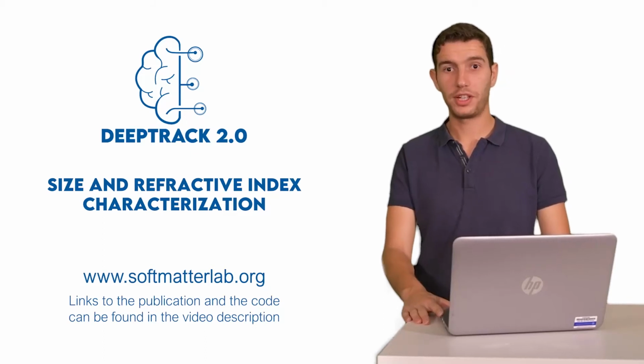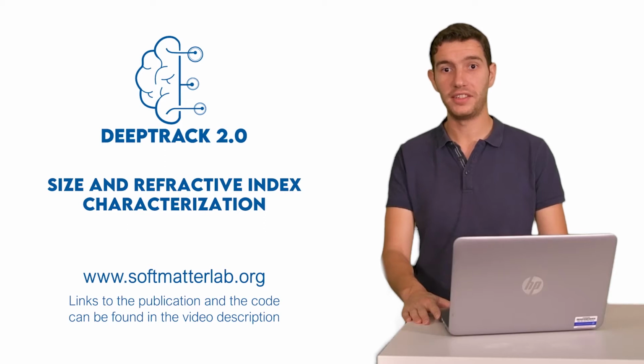In this tutorial, we are going to use DeepTrack 2.0 in order to characterize the refractive index and the size of microscopic particles. Hello, I am Aykut and I will be your guide for this tutorial.